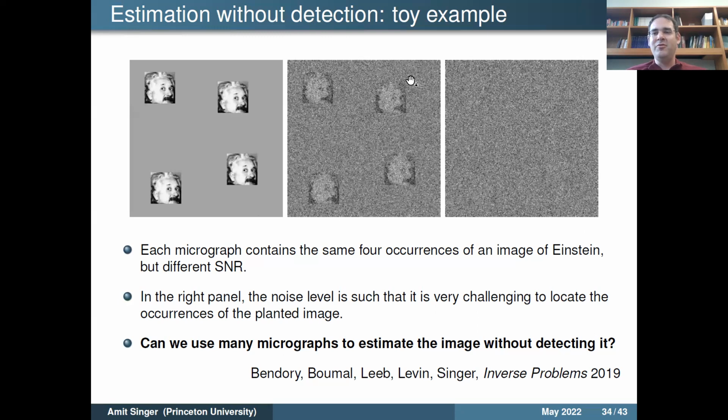The average pixel value of noise would be 0. It will cancel out, and we'll get some, though very little, information about the Einstein image. Then we can go to second order correlation. I'll take 2 pixels, multiply their values and average over the entire micrograph, every time with some different displacement. So I'll get the autocorrelation function.